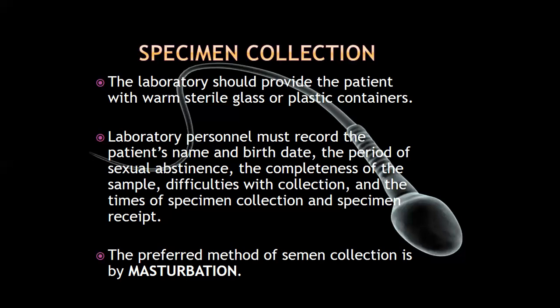Now, what you need to do is that from the time of complete ejaculation, you need to wait at least 30 to 60 minutes before you could do the semen analysis. That 60-minute period will be the time for the entire coagulum to liquefy. In other words, the purpose of noting the time of specimen collection is to note the time of liquefaction. I will be discussing that in detail later.